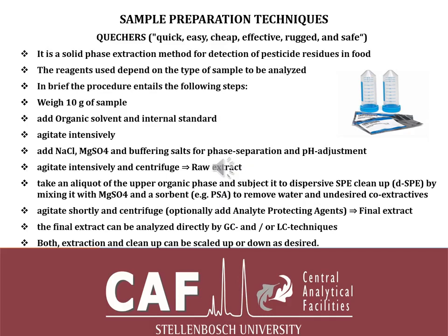By introducing the hexane, we also improved the sensitivity of the sample prep, because sometimes when we speak of sensitivity, people think it is only instrument related. They forget that the instrument can only give you what you've injected. Before you speak of the sensitivity of the instrument, one needs to make sure that you've already exhausted everything you possibly can on your sample prep.